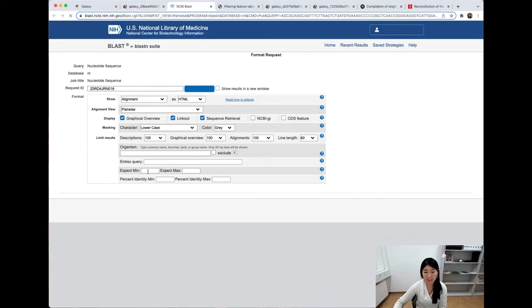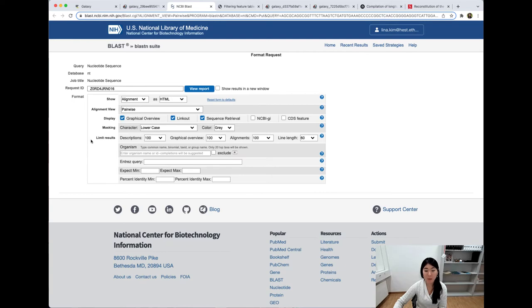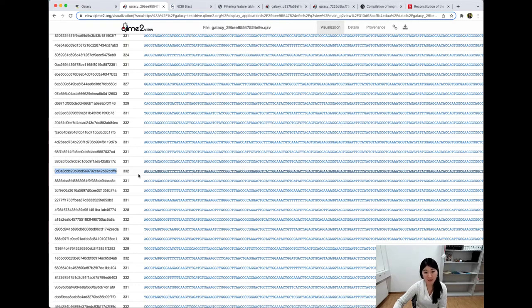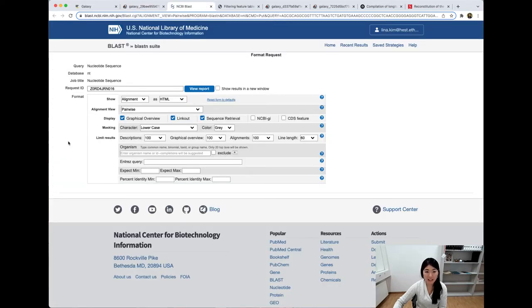Let's go back to our sequence summary tab and use control-F and control-V to look for it. This is the sequence we were interested in — a nucleotide sequence that corresponds to this ASV. If you look closely, you'll see that this nucleotide sequence is actually a hyperlink. If we click on this link, it'll take you to the NCBI website and enable you to perform a BLAST search with this nucleotide sequence against NCBI's database of different genomic data.